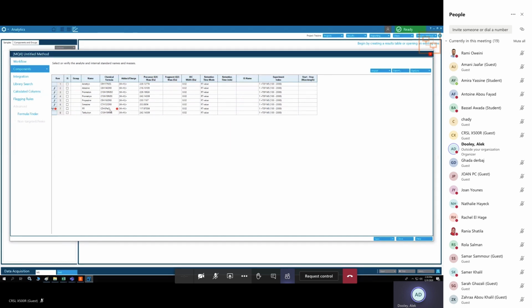Li is lithium, right? You have to write a big C and a little l if you want chlorine. And conversely, for lithium, you write a big L and a little i. Don't write big L and big I, because that's lithium and iodine. That one I know. Makes sense? So you have to follow exactly how it is on the periodic table.